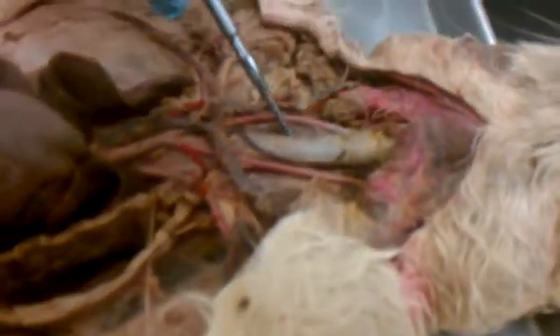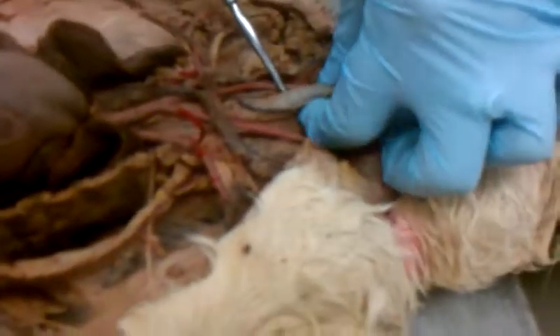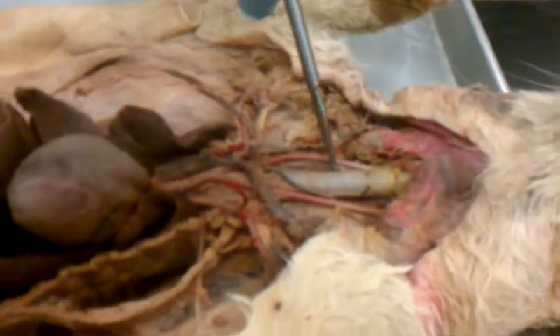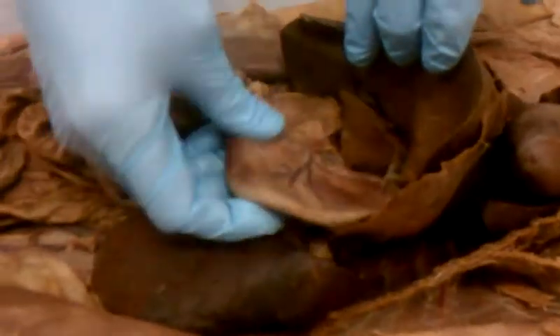So, the esophagus. The esophagus is underneath the trachea. So if I pin something that's underneath here, we didn't dissect it out, that's where the esophagus is. And this, of course, is your trachea. So underneath here is your esophagus. And then we have what I showed you earlier. This is the stomach. That big old thing. Pretty empty stomach.